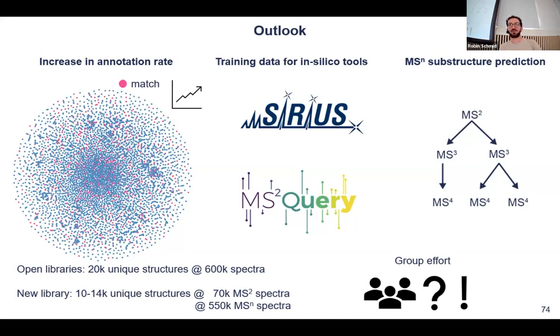And that's also what we try to do, so that people know what happened to the spectra, that we can apply some filtering, we can automatically tag the spectra. And then people can also say, I only want the spectral libraries of this person and this machine. So you can basically filter by metadata and also by tags and say, okay, I want some very confident MS2 spectra.